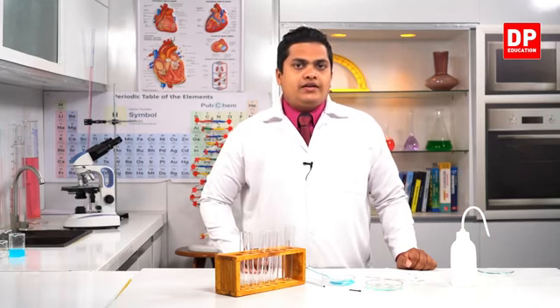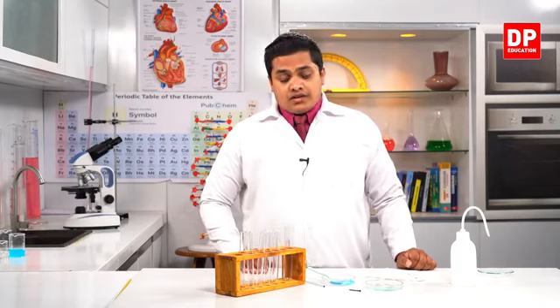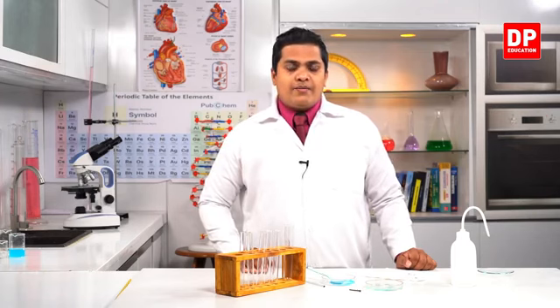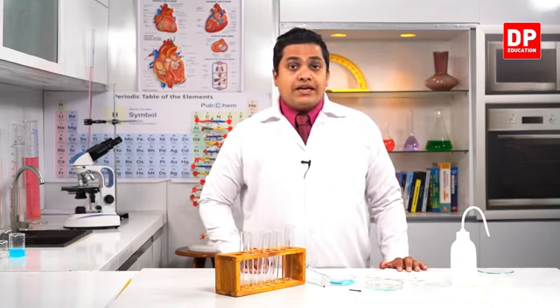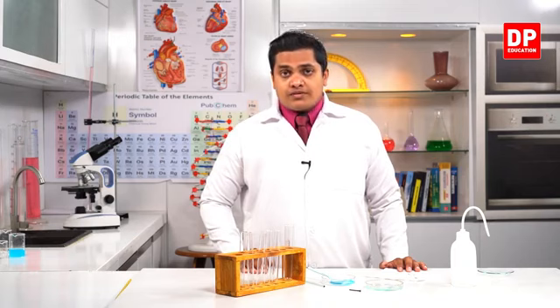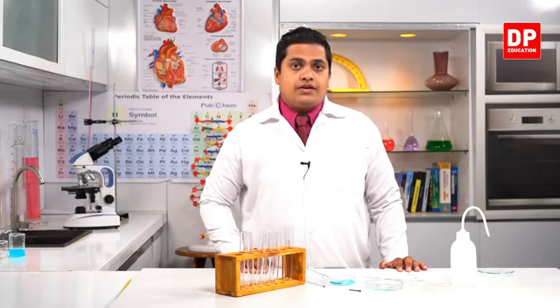And the third proof is that if the complexion or the color of a system is going to change during some sort of a reaction, or else in some sort of a change, in that case also we can say that this reaction is a chemical reaction, or this change is a chemical change. So we can provide three evidences by doing this experiment. Those three evidences are, in a chemical change, a precipitation may occur, a temperature change could be observed, and a change in complexion or change in color can also be observed if there is a chemical reaction.